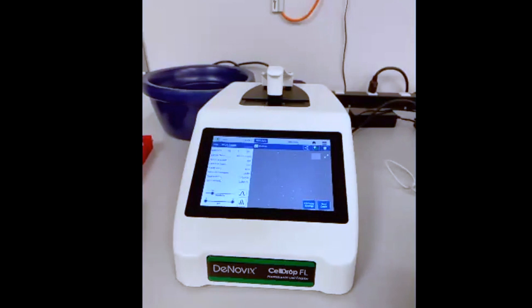I don't think we have a tech note or anything in particular about that, but I don't see why it wouldn't work. It would just be something you would have to try out. Since sperm aren't terribly round, you might need to adjust the count parameters quite a bit, but it is possible. And you'd need to fix them, clearly. Yes, good point. They can't be live, then they'd be moving.